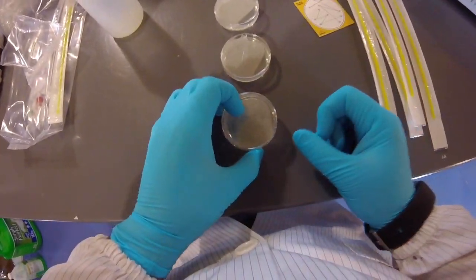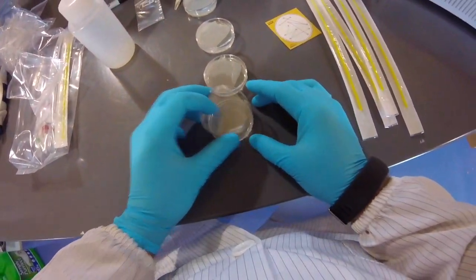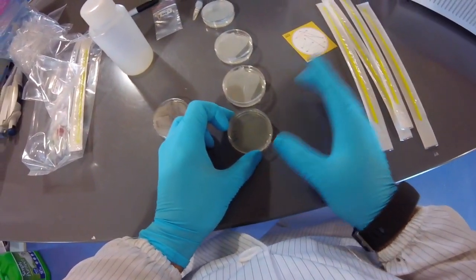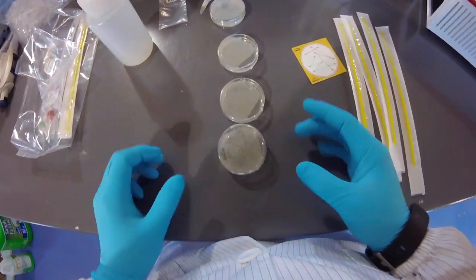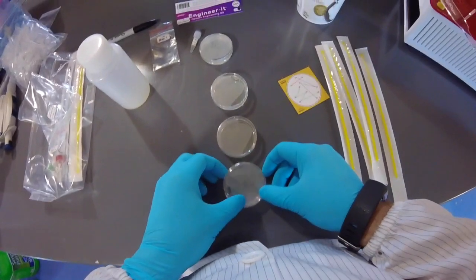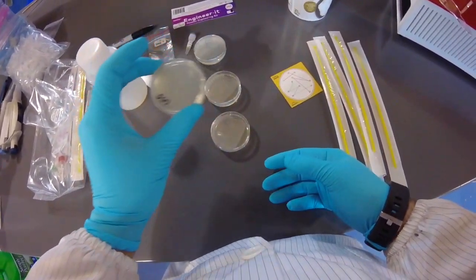One thing you can do as you're waiting for them to dry is take off the lid, have it on the table, and give a little tap on the side. If you see it jiggling at all, then you need to wait a little bit longer. But once they're cooled down to room temperature, they should definitely be solid.